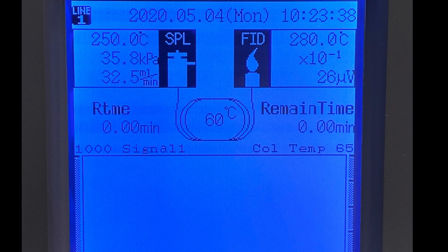After your instructor programs in all the variables for your run, you should check it for the injection port temperature — here you see it's 250 degrees Celsius — and the column temperature, 65 degrees Celsius.